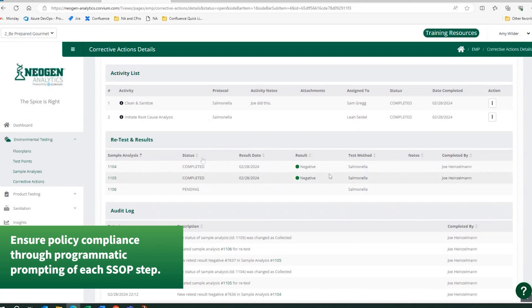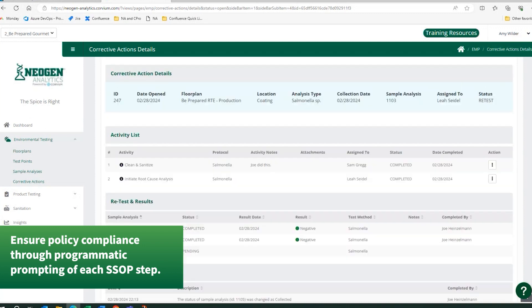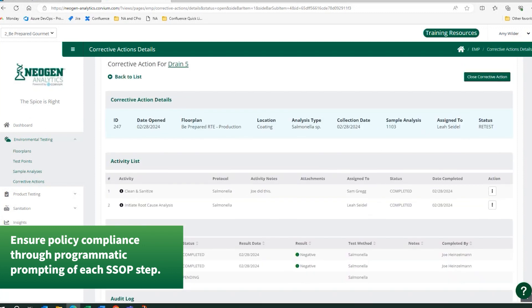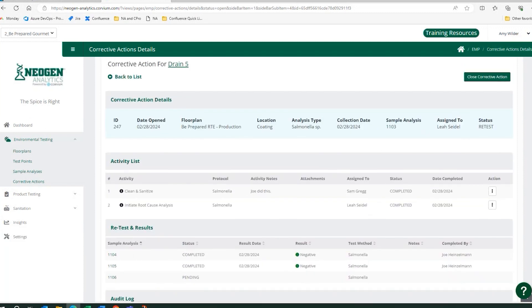Once both of these sections are complete, the software would recognize that this corrective action is officially passing the criteria established in settings.